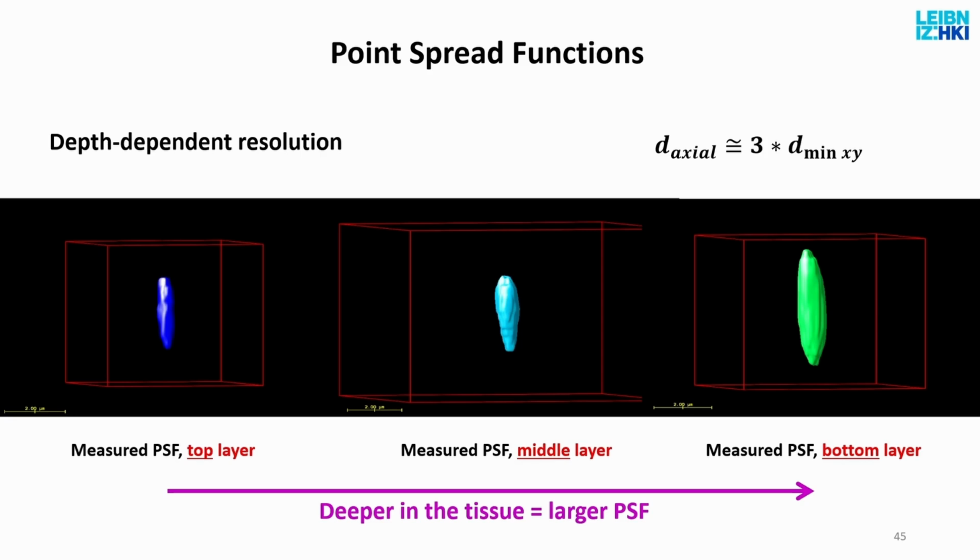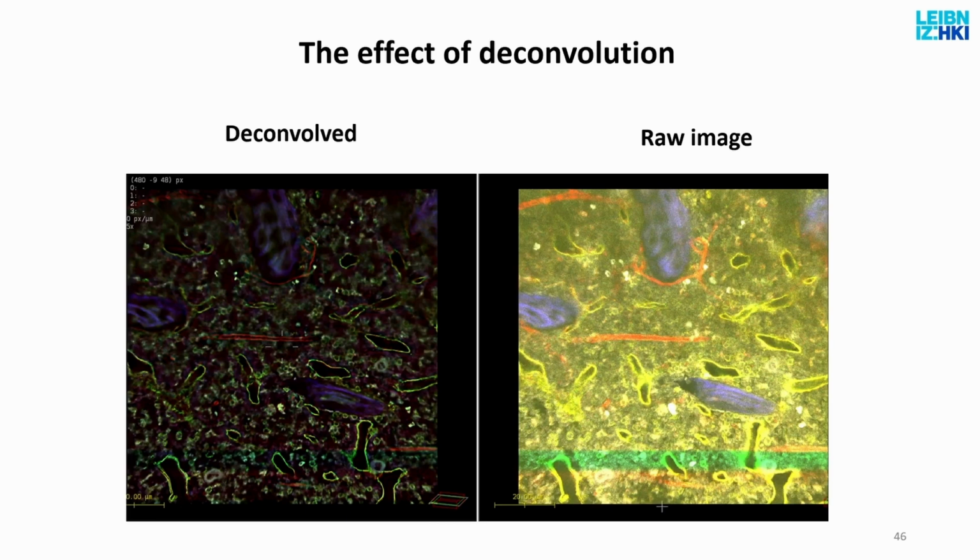So this means that if I don't measure this, and I try to calculate what the image would look like without the microscope, so what would be the best image, I will underestimate the effect of the microscope. But what if I measure them? Then I can invert the smoothing function. The smoothing itself is called convolution, so the inverse is called deconvolution. This is the same bone marrow I showed you. After deconvolution, it looks like that.